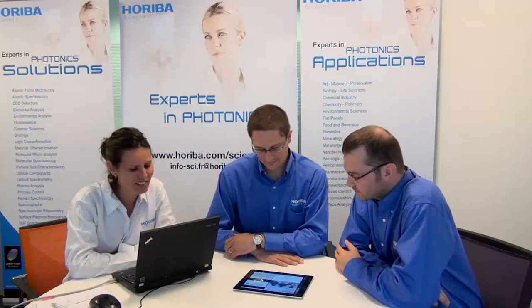So last question. When measuring samples with a really low fluorescence signal, is there a way the signal can be enhanced using a Fluorolog 4 instrument?